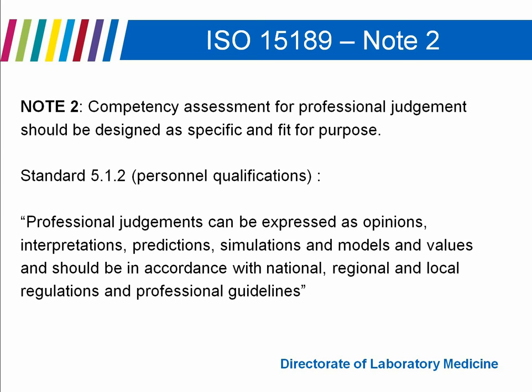So there immediately we can focus on the fact that it's referring us to national, regional, and local regulations and professional guidelines. So, as was discussed this morning, the BCSH standards, guidelines for flow cytometry, multicolour flow cytometry, come into play, and we should adhere to those.